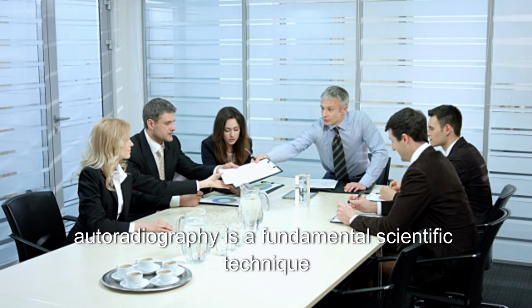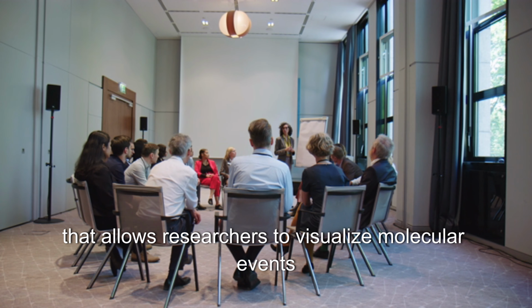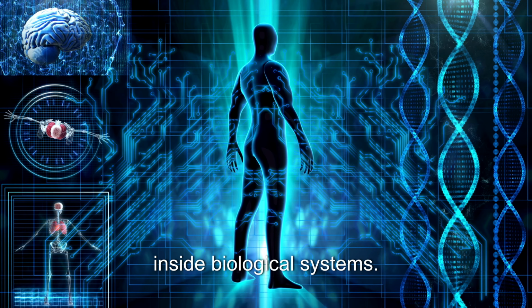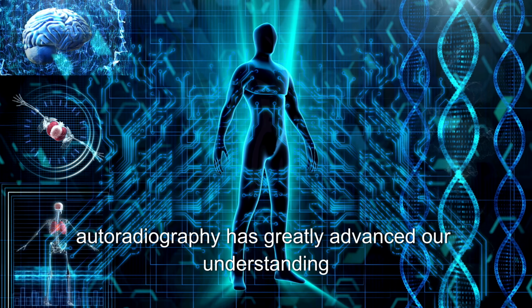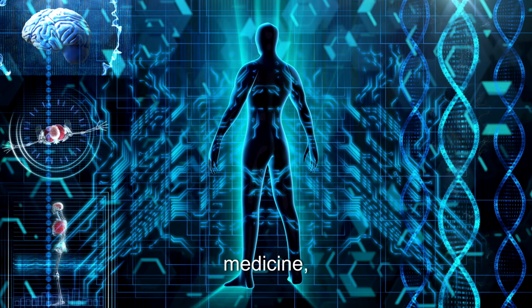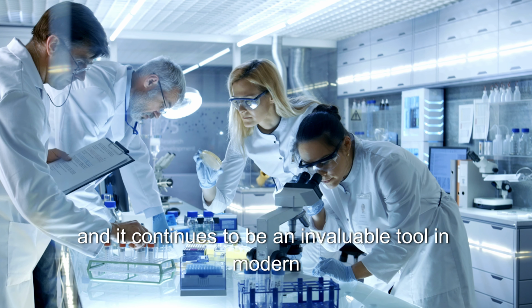In conclusion, autoradiography is a fundamental scientific technique that allows researchers to visualize molecular events inside biological systems. By revealing the precise location of radioactive molecules, autoradiography has greatly advanced our understanding of biology, medicine, and drug development, and it continues to be an invaluable tool in modern research.